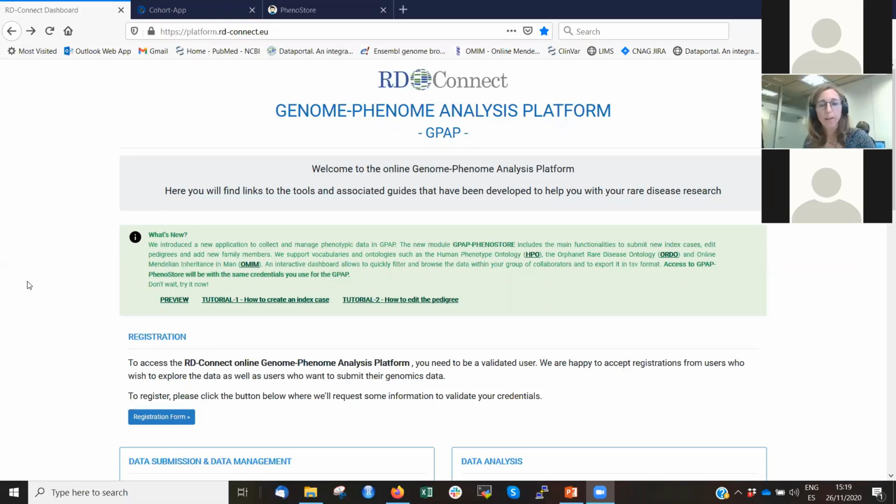Yes. Okay, perfect. So now the idea would be to show you how to enter a case in the system and also a couple of other features, and then we'll have time for a discussion with Steve. So this is the landing page of the RD-Connect platform.